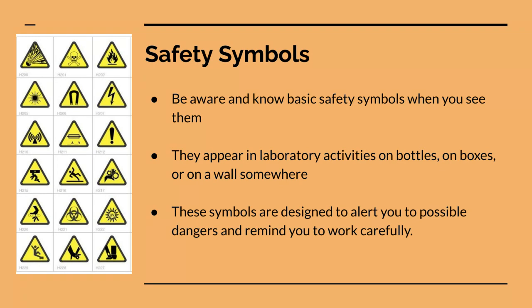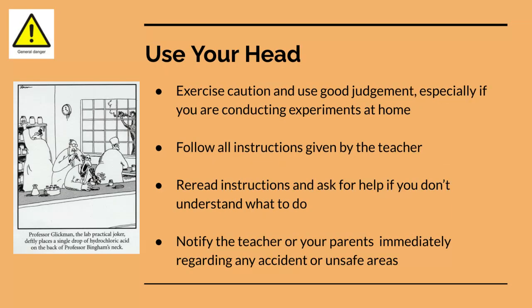They appear in laboratory activities on bottles, boxes, or on walls somewhere, and these symbols are designed to alert you to possible dangers. It's more of just reminding you these safety symbols are there. Be careful, whatever they may be, and most of these I'm sure you already know because you've probably seen them before.